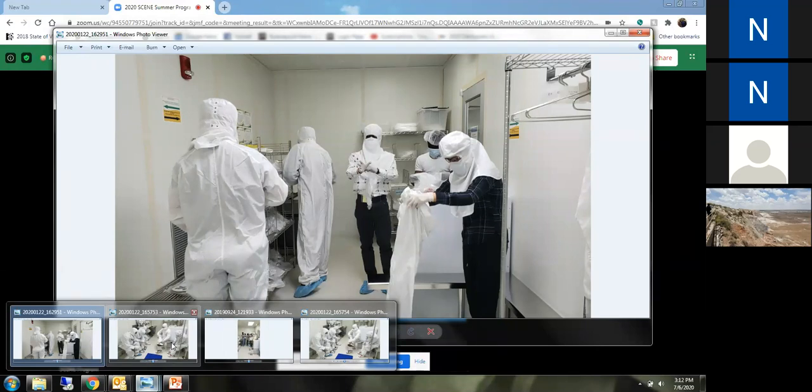Okay, so I think you answered what happens to the gowning after it is used, right? Actually, I can add a little bit more. We allow students to wear the garment 5 times. 5 times does not mean 5 days. You can go in the clean room 3 times today and maybe 2 more days this week. That's 5 wears. So that garment has to be put in the laundry basket.